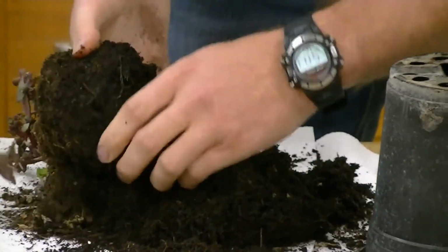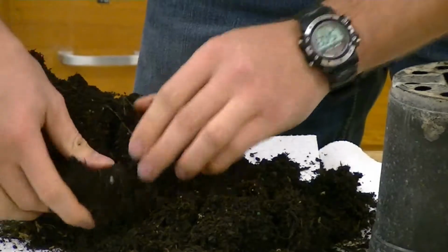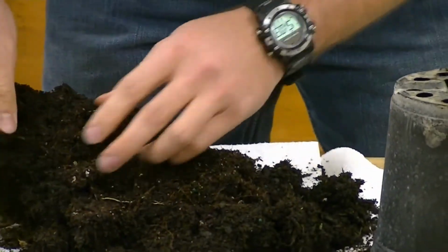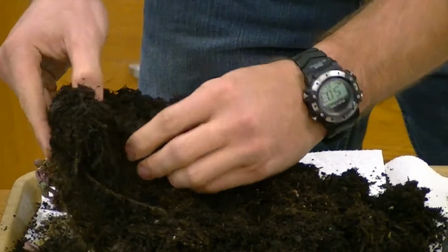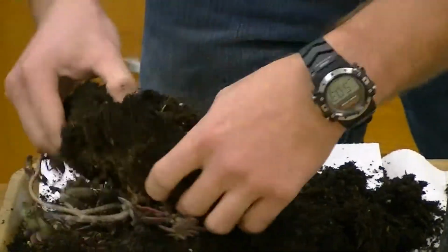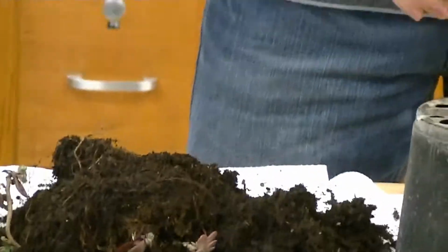And so what you're basically going to want to do is kind of rip that ball apart and find some nice amount of root tissue that you can use. And once you get some of that root tissue isolated, we're going to probably put it in a handy dandy mason jar for cleaning.